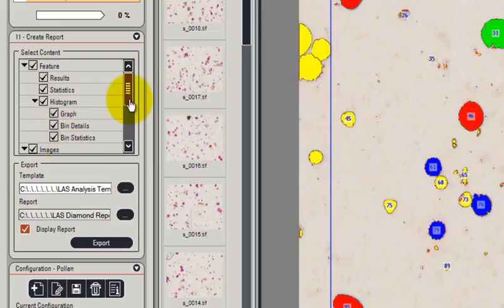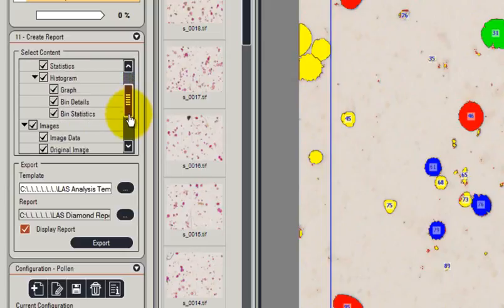In practice, what is usually done is that most of the data is exported, because you can then save it, and perhaps you will be able to analyze it again later. If you hadn't saved the data, then you wouldn't be able to do that. So it makes sense to transfer it all.